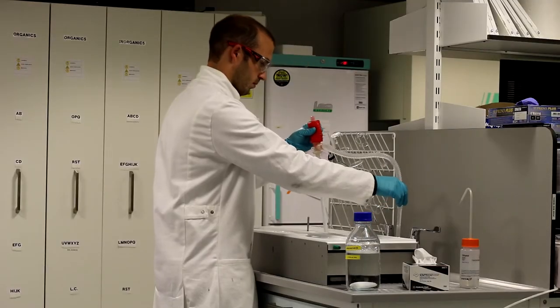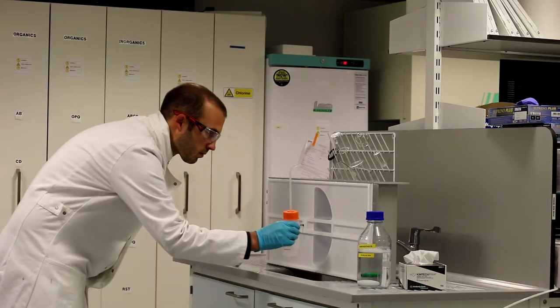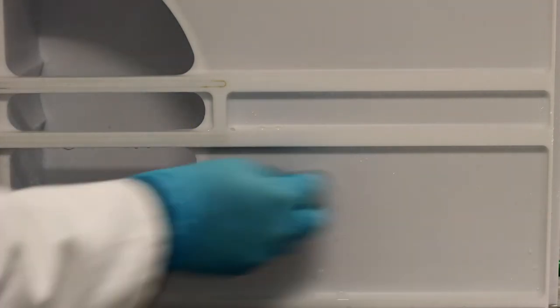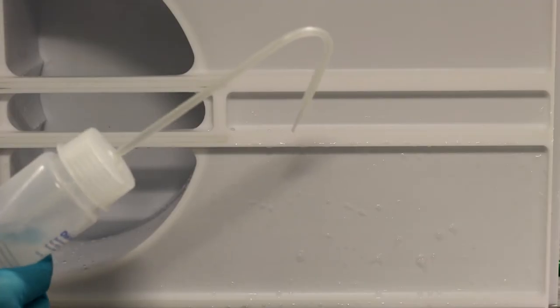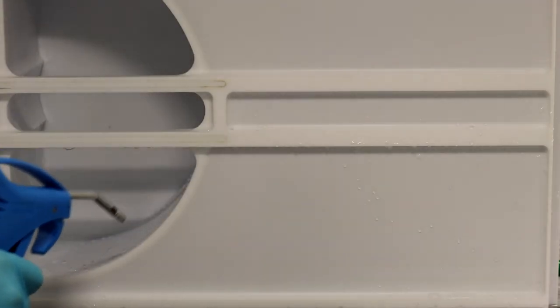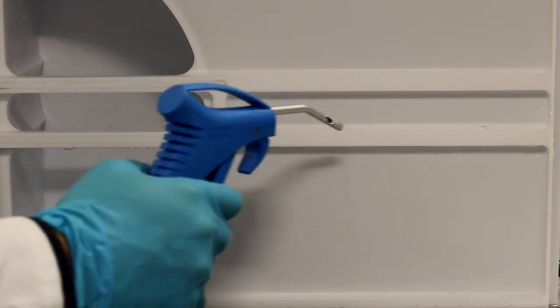I like to start by cleaning the trough and then the barriers. Gently wipe down the surfaces with your detergent solution until it foams. Then rinse off the detergent solution using deionised water and a nitrogen gun. Repeat this rinsing sequence several times.